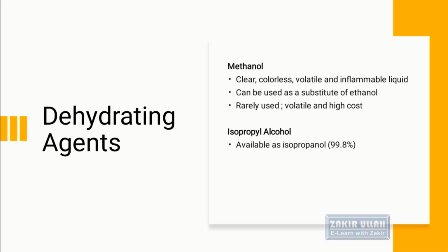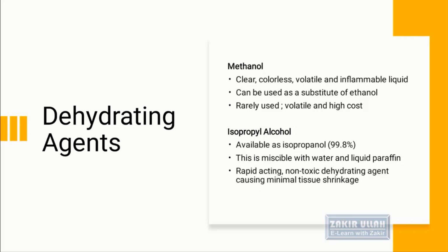Isopropyl alcohol is also used and is available as isopropanol at 99.8% concentration. It is soluble with water and also with liquid paraffin, so it is also used. It has a good and fast action, is a non-toxic dehydrating agent, and causes minimal tissue shrinkage. It also has good dissolving properties for lipids.